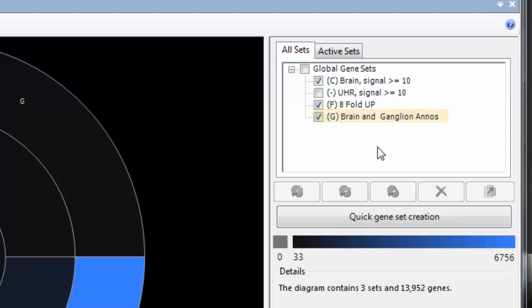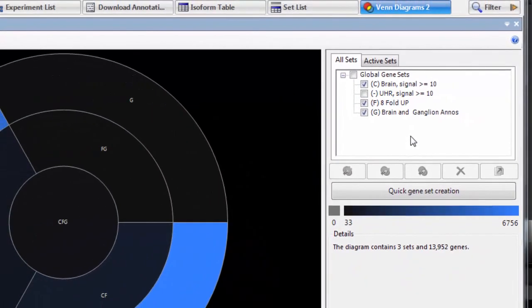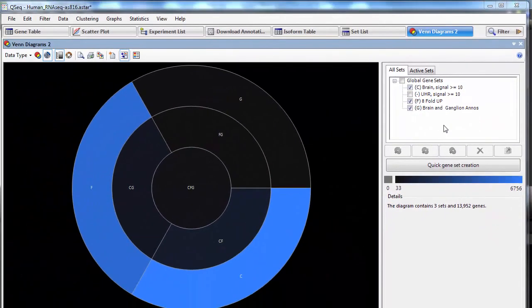This will help me see how many upregulated genes in the brain sample have a gene expression annotation that supports brain tissue expression.